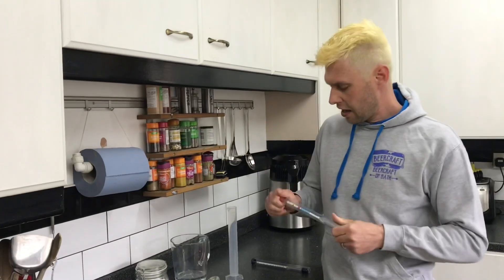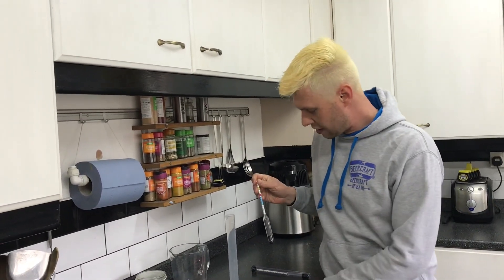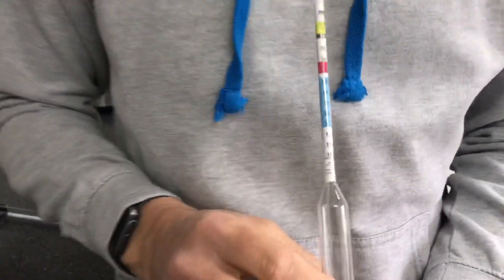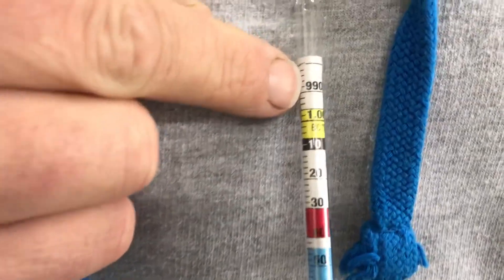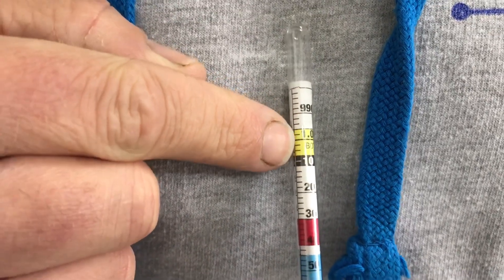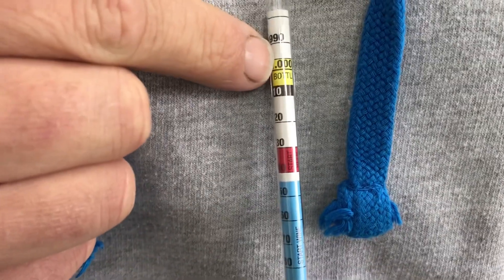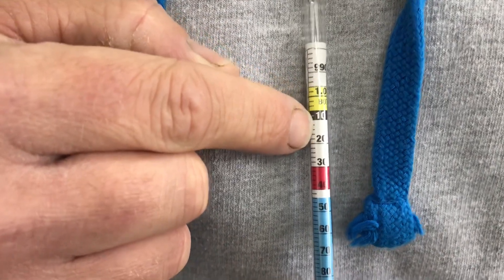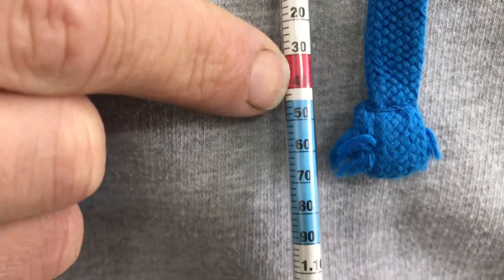Let's go with this hydrometer first. This is what's normally called a beer and wine hydrometer, and there are a few different readings on here. It starts up at the top at 990, then 1.000, and then goes up in increments of 0.010 — so 1.010, 1.020, 1.030, 1.040, and so on.